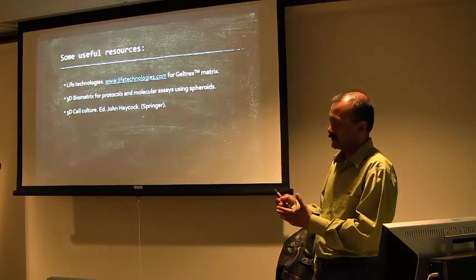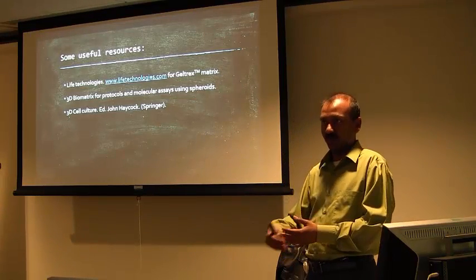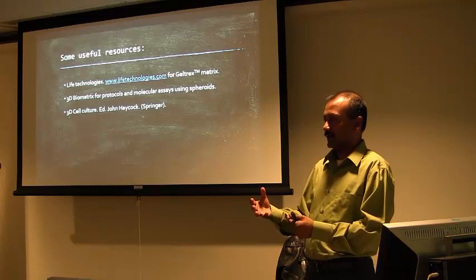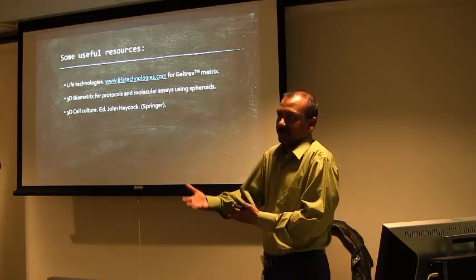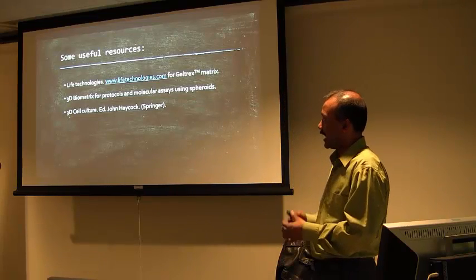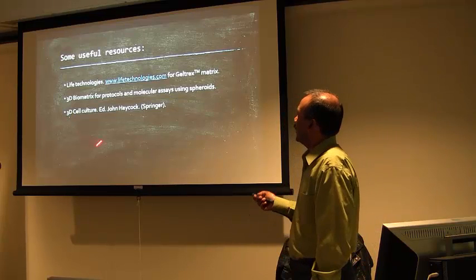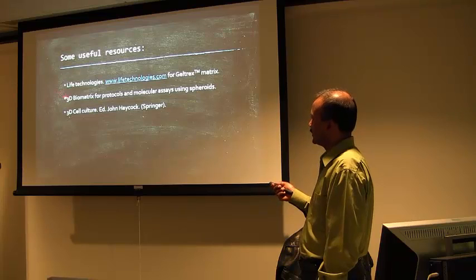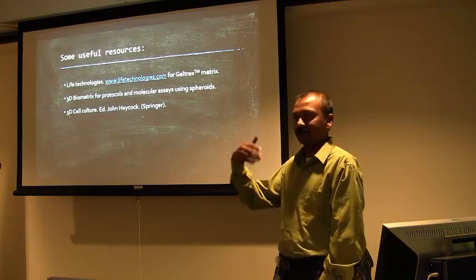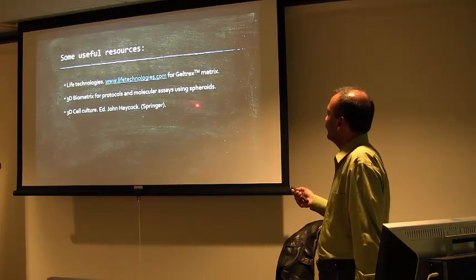Our choice of matrix was based on previous efforts of other groups who tried to grow melanocytes. They found that laminin and collagen increase survival, so we used a matrix that had laminin and collagen in it. Also, 3D Biomatrix is another company that recently put a lot of free protocols on their website. You can just go through and use them.